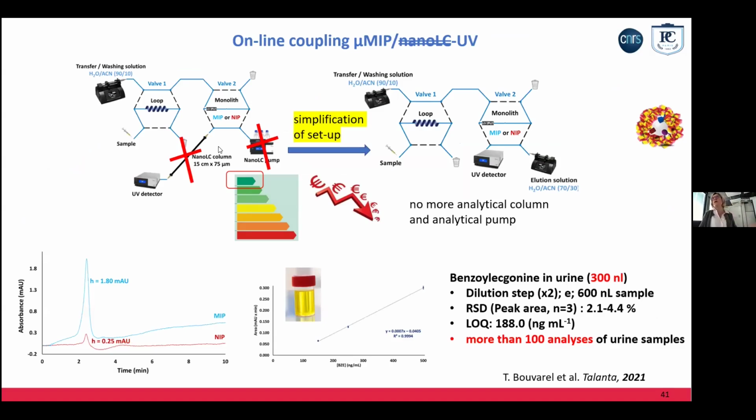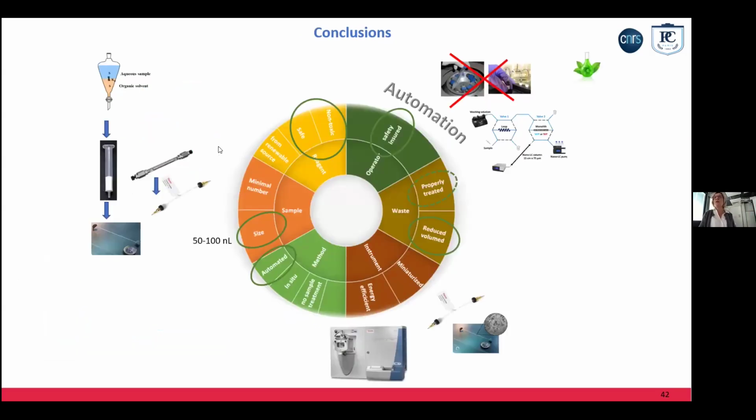We can really have a very simplified and inexpensive system to follow our target in very complex samples, combined with very small amounts of sample. So I hope that I convinced you that we work on finding how to remove all the organic solvents in our procedure and to keep high potential methods.